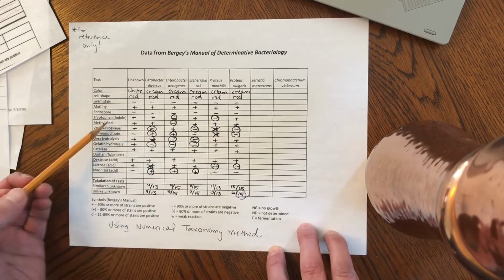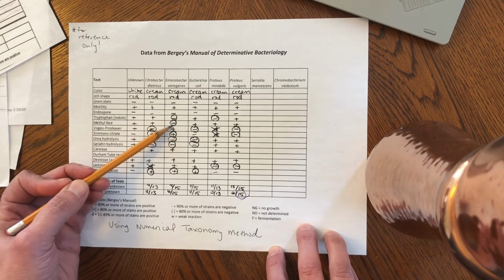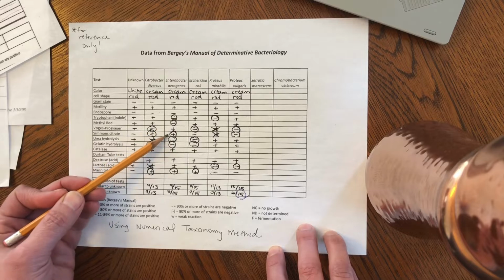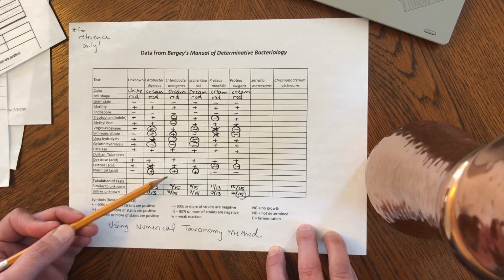So anyway, tryptophan doesn't match. Methyl red in this case doesn't match, so it's circled. Simmons citrate doesn't match, so it's circled. Urea doesn't match. So you can see the situation here.